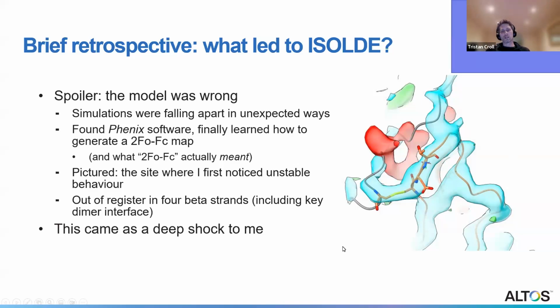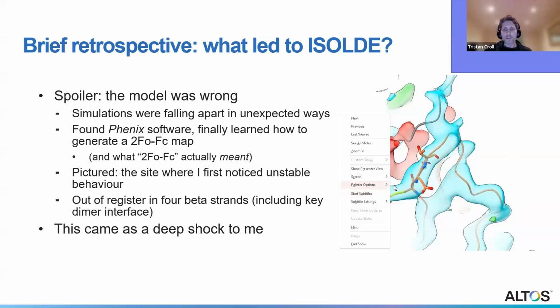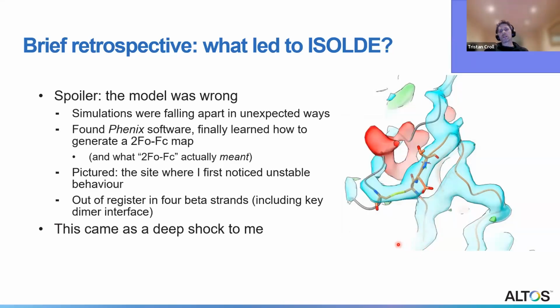I hope, yeah, just bring up a pointer. I hope you can see, starting by watching this gray strand down here, where it jumps out of density and heads off to the right through a great big positive, negative difference peak, where it fairly clearly should be just coming down here and back up here. And the orange strand here has been threaded through what is actually the disulfide bond density, and should really be just forming a little helix here.